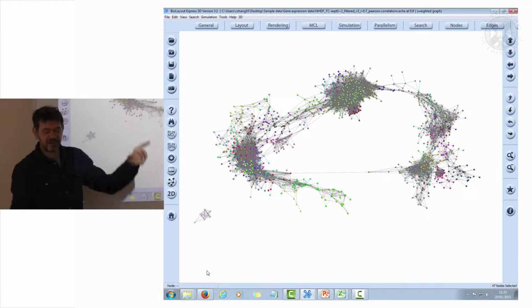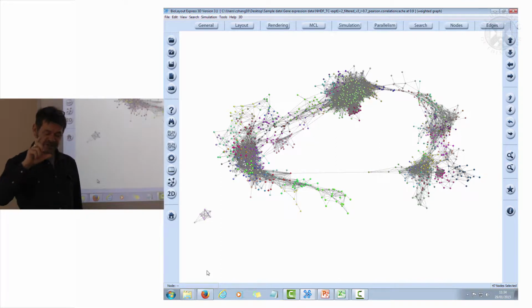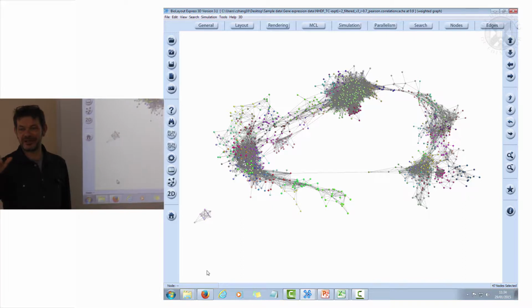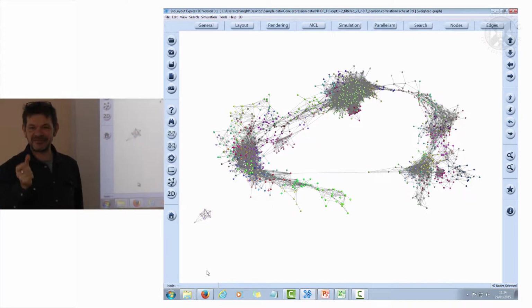In that second experiment, which was run on a series of 4 strip chips, one of the strip of chips worked differently. Again, there's a set of genes which are highly expressed in those 4 there.